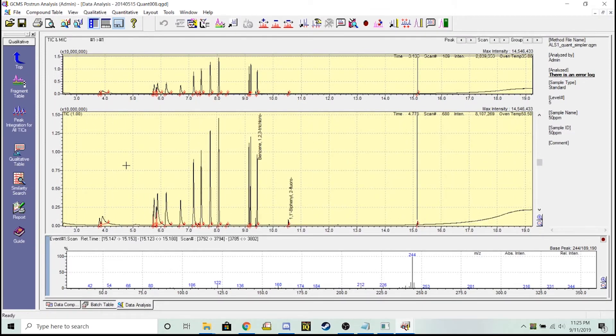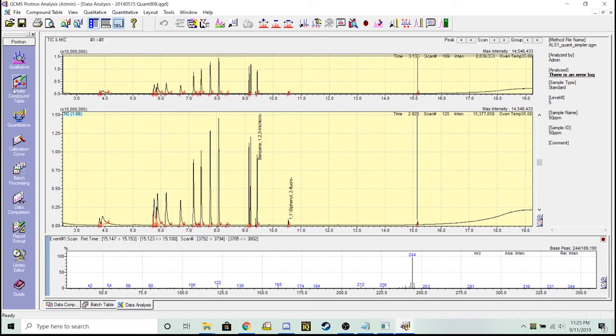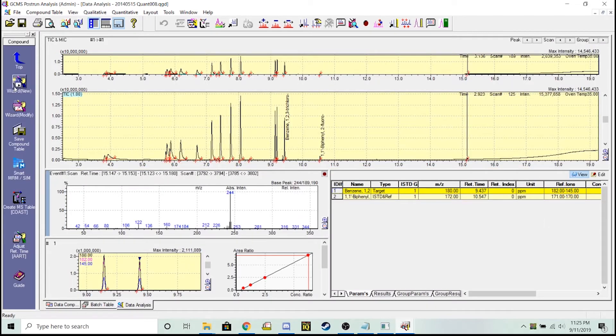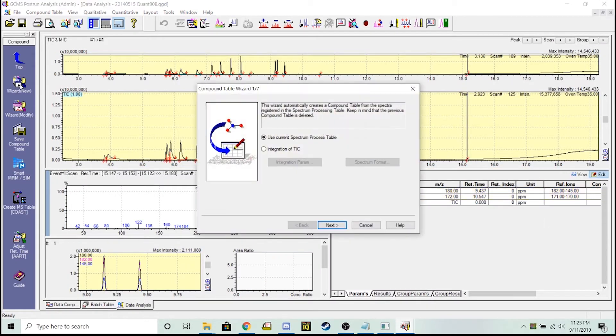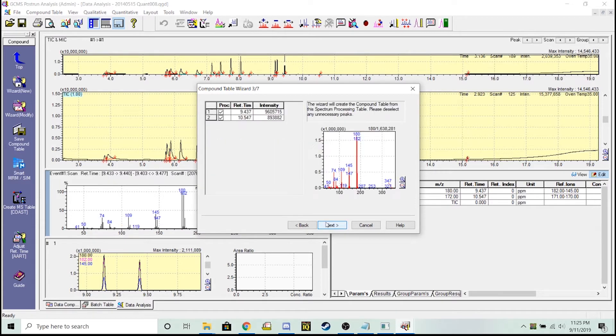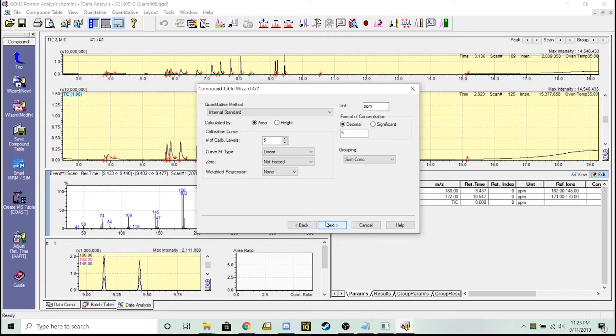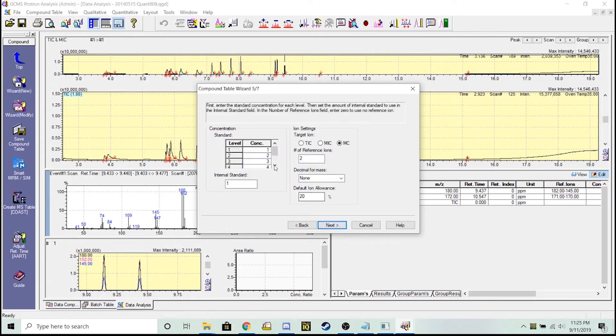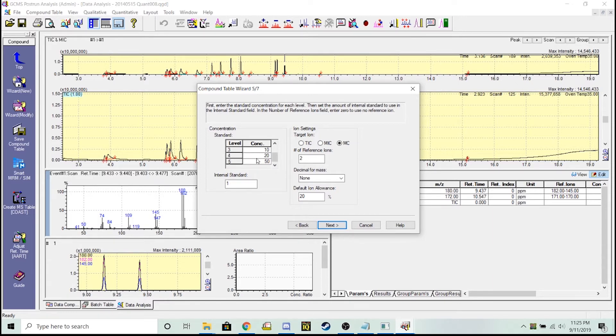Now I'm going to load these things from the spectrum process table into my creating compound table. Go to create compound table wizard, new. We're going to tell the method not only the different calibration levels, the 1, 5, 10, 20, 50, but also the internal standard levels which should be 8 ppm in this data file. Here's where I changed the targets: 1, 5, 10, 20, and 50 ppm with 8 parts per million on my standard.